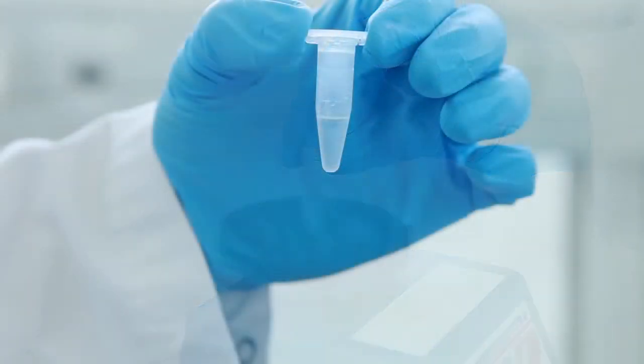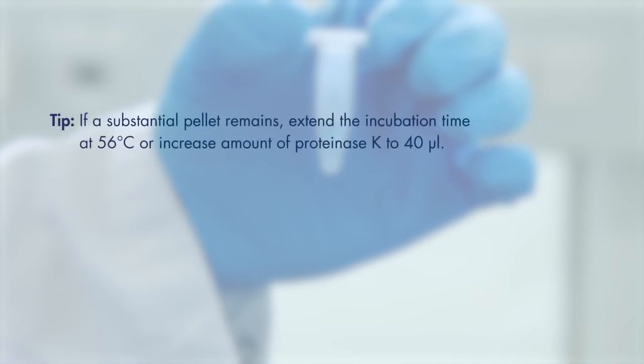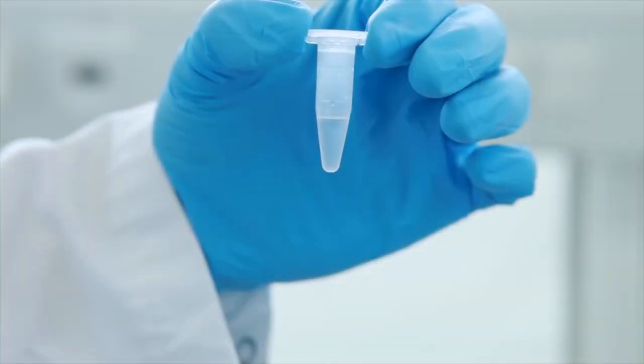To increase the DNA yield, try the following tips: reduce the amount of starting material to ensure the sample is fully lysed. If a pellet remains, extend the incubation time or increase the amount of proteinase K.